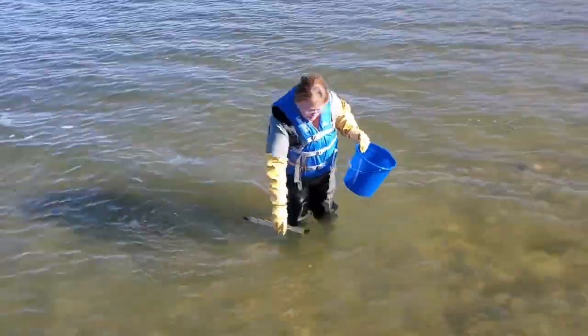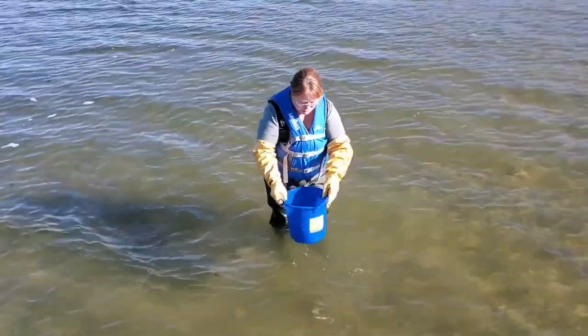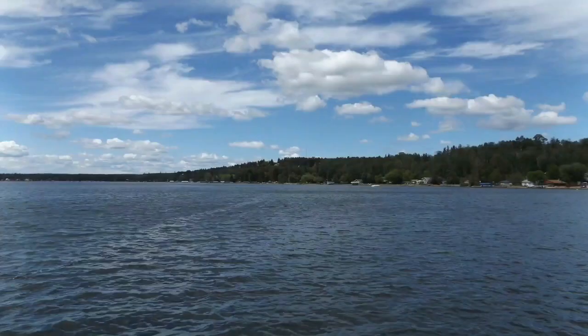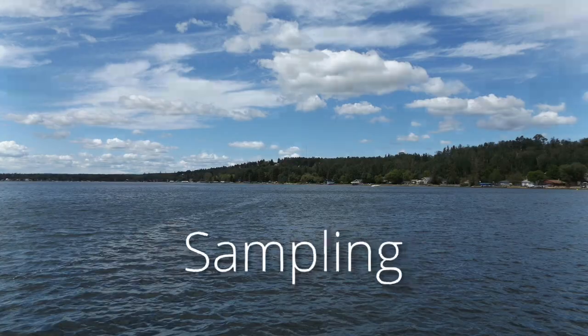Begin by rinsing the pail and the wine thief in the lake water where the sample is to be collected. Allow the water to run through the wine thief a couple of times and ensure that the pail gets submerged fully. Walking around in the water will cause the sediment to plume, so wait until it has settled to dip the wine thief in the water to sample.